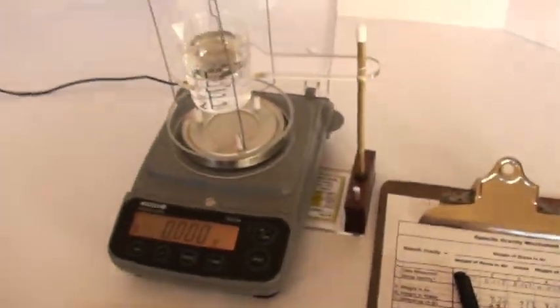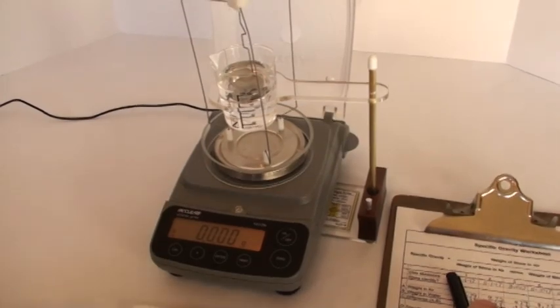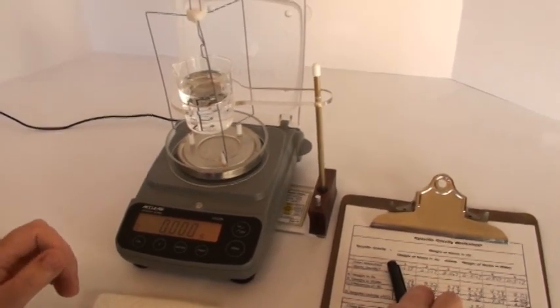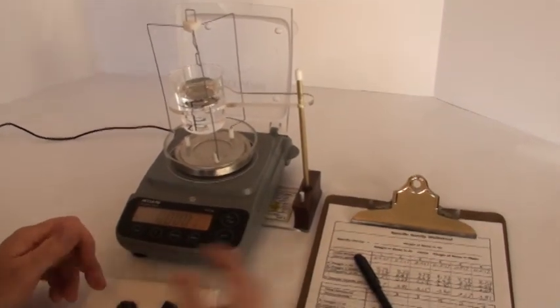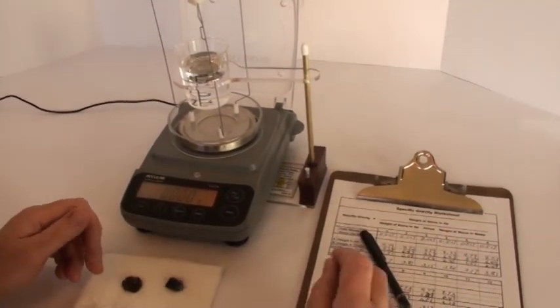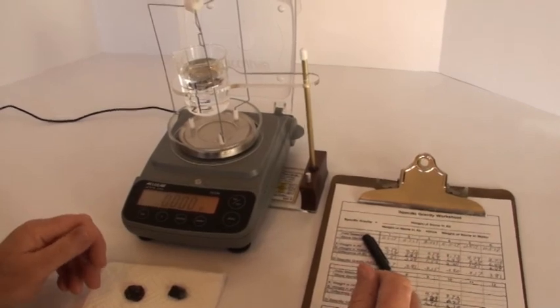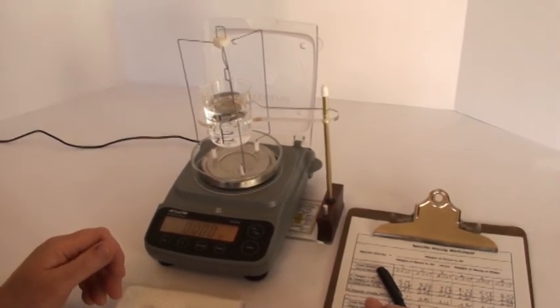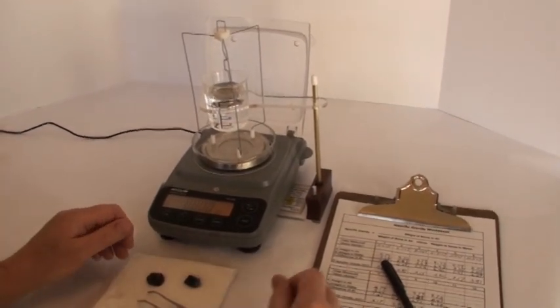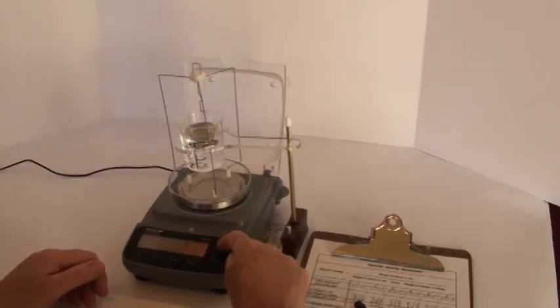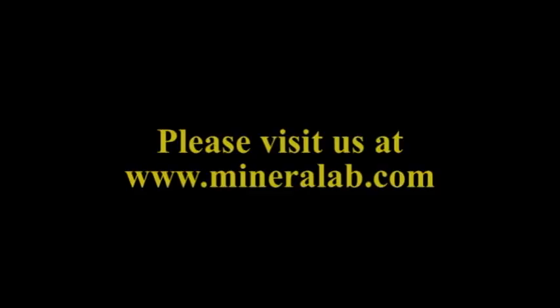So this method and this apparatus is quite accurate and, as you can see, also user-friendly. That's all there is to it. You can just get set up and do a large number of specimens very quickly. If you have any questions, you can go to our website minerallab.com. There's a contact us page. And I want to thank you for your time.